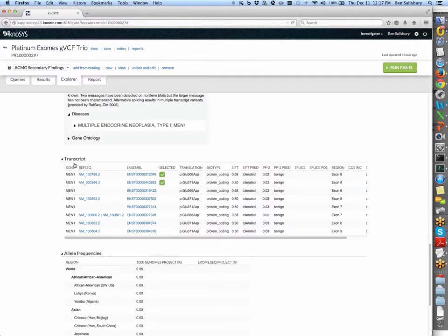There are many transcripts for this gene, 2 of which were specifically interrogated in this analysis, due to them being suggested as the clinically most relevant transcripts by sources such as RefSeq gene or the locus reference gene database.